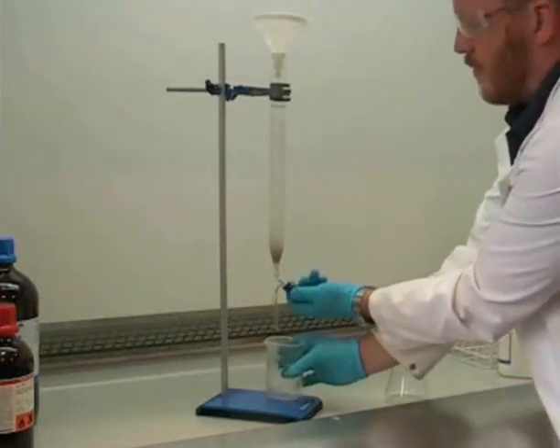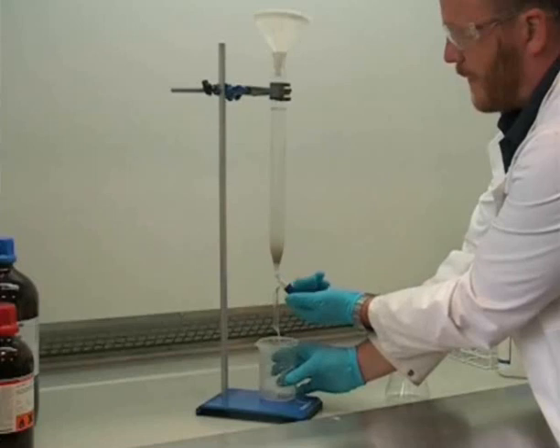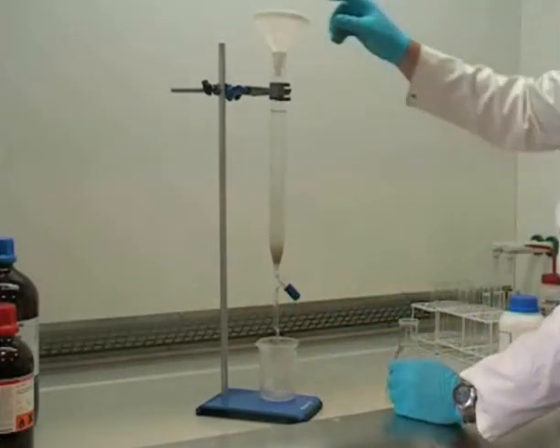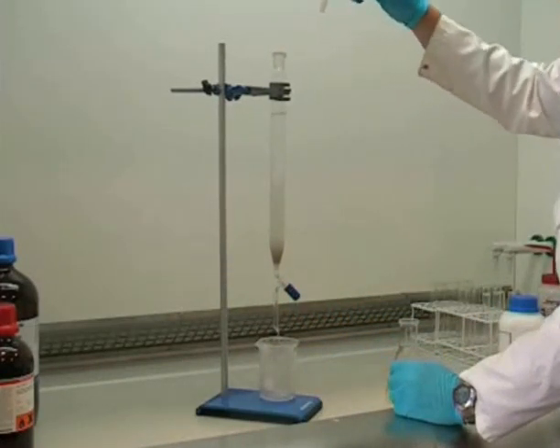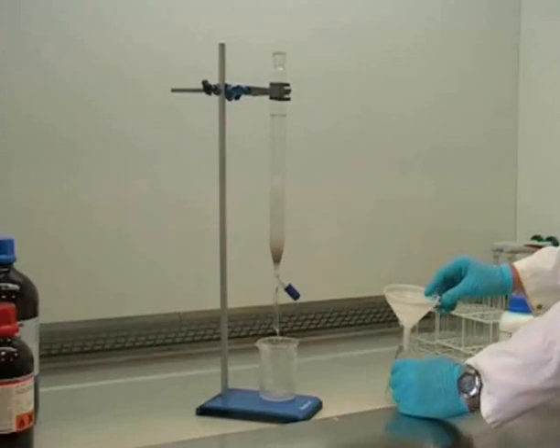Should the level of the eluent get close to the top of the column, then some of it should be removed by opening the tap. We can run this into the beaker, which will then assist us in making a slurry with the remaining silica.